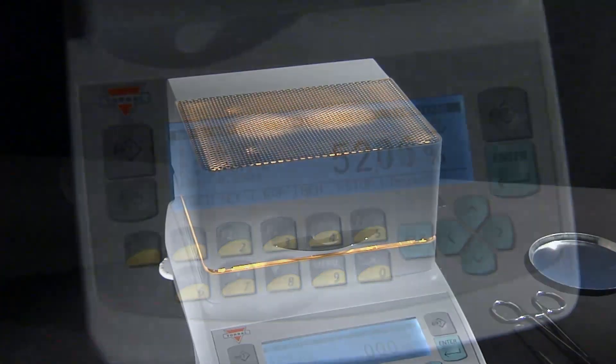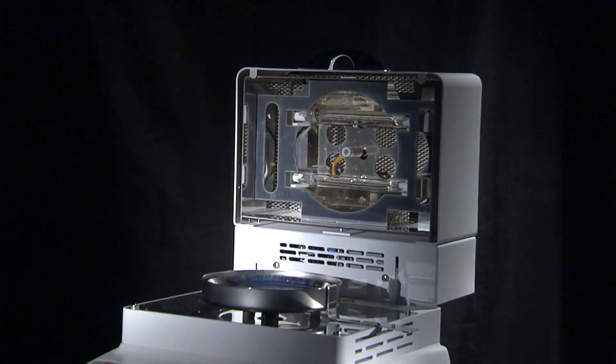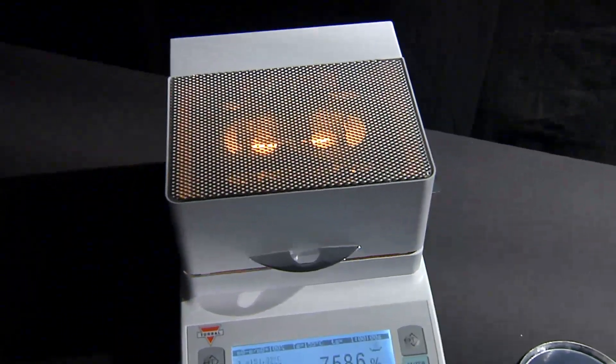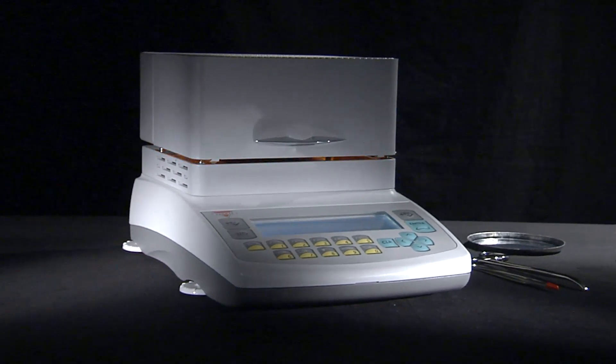Each unit is equipped with a halogen lamp drying oven, which uses two heating elements delivering 250 watts of drying power to provide high-speed infrared heating. The unit's robust die-cast metal housing makes the AGS ideal for applications in tough environments.